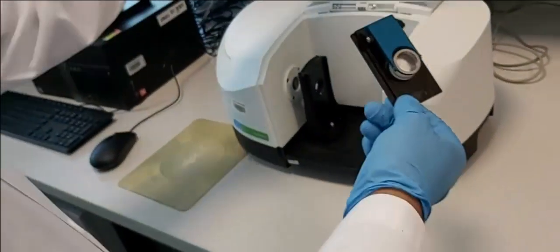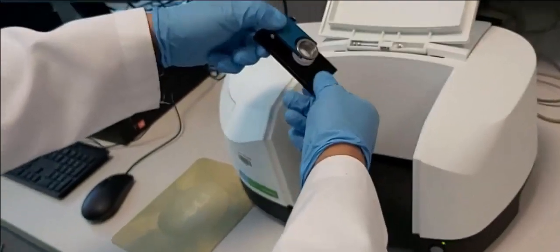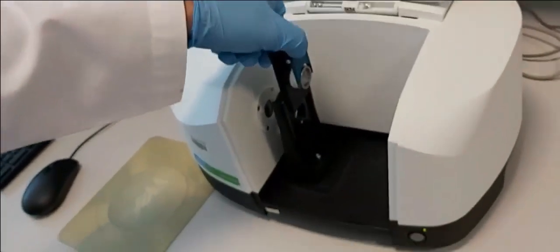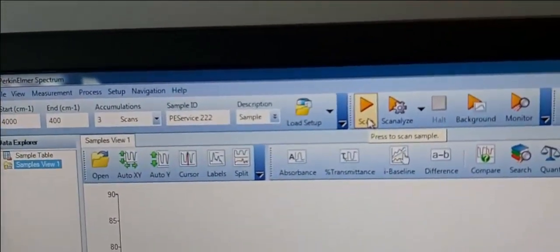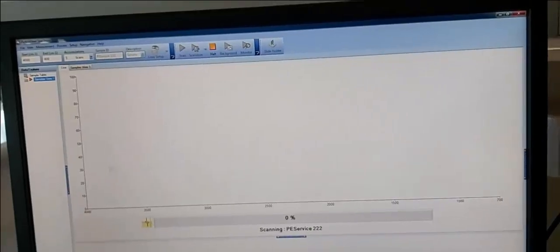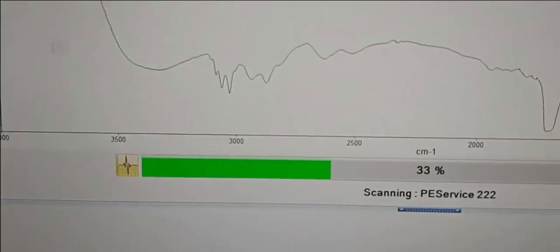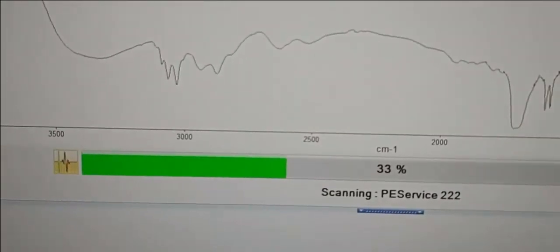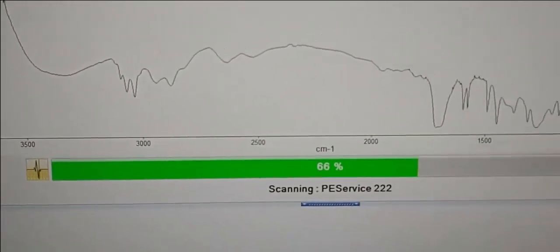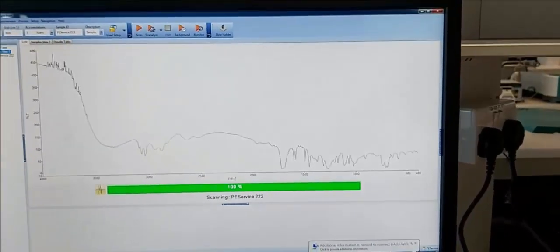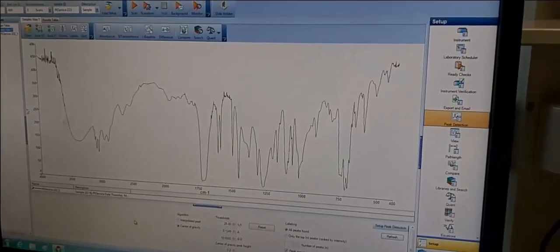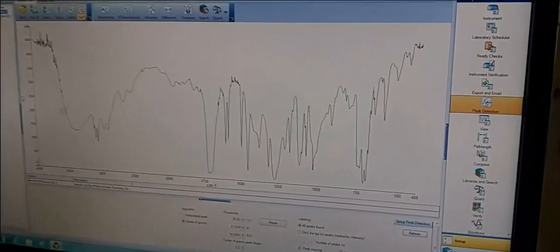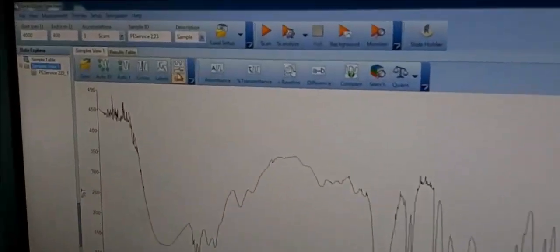We place the two disks in the holder and fix the holder on the IR apparatus. Then we go to the computer software and click Scan. In a few seconds the spectrum appears. After we get the full spectrum, we click on Labels and the peak numbers appear on the screen.